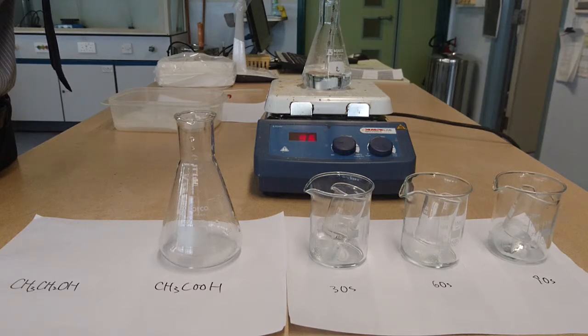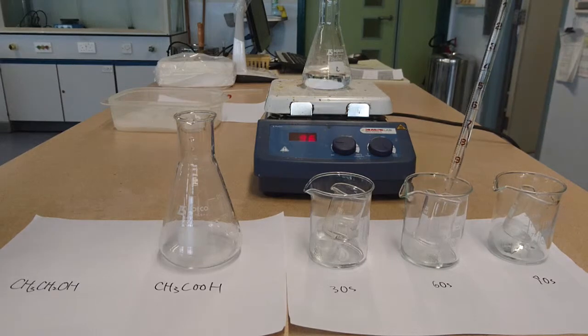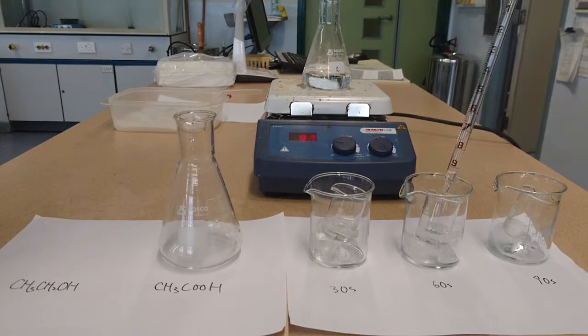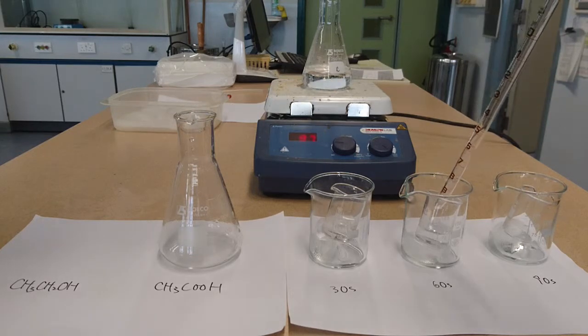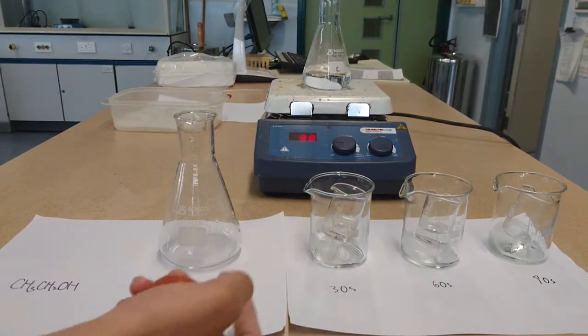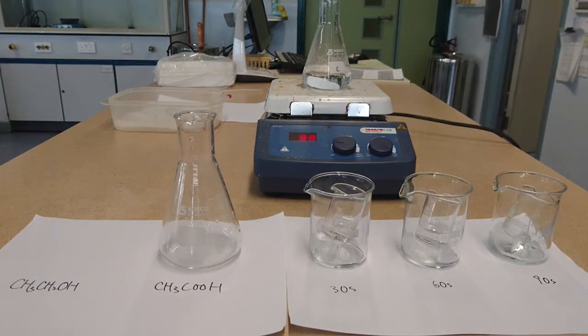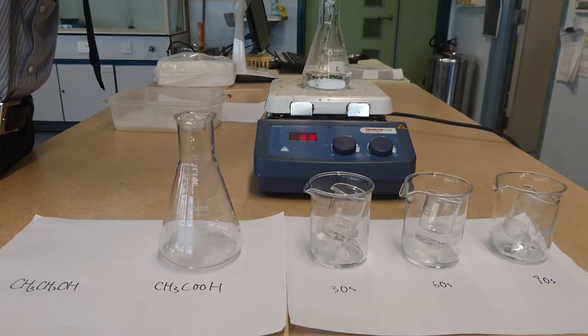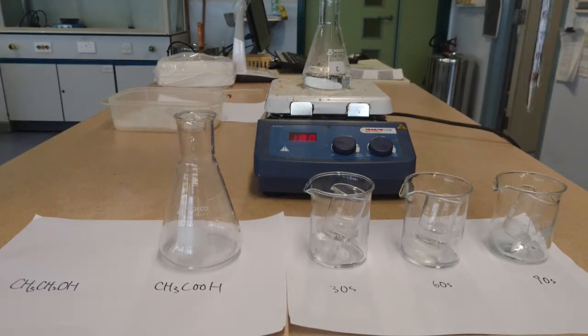Once again, another 30 seconds passed. So I add into another new small beaker, the 60-second one. And then you can see that the time is almost there. Okay, now you can see the ice is being chilled here under the small beakers, so it will be so-called cooled. But better, we'll have some water inside to have a better cooling effect using the ice cold water. And next up, I'm going to add the last bit. Okay, and then add it here.